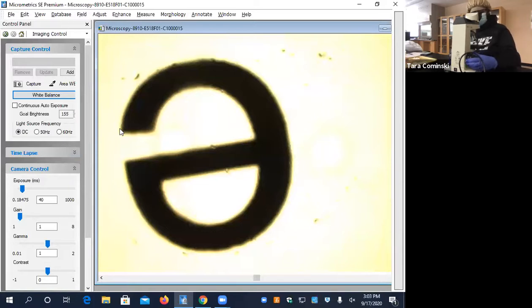Did you get it? Oh, you got your eyelash? I keep popping up my eyelash, so I think I need to comb them up. Yeah, you have to get used to that. This is why you have to get used to using this. It's not something that you just watch somebody use and then know how to use it. You don't.